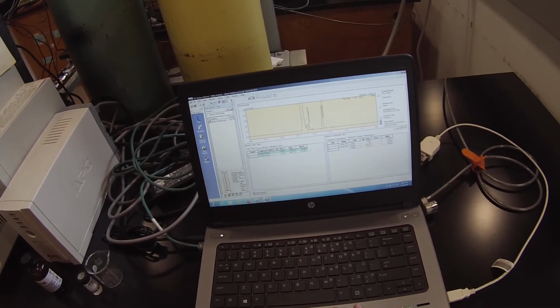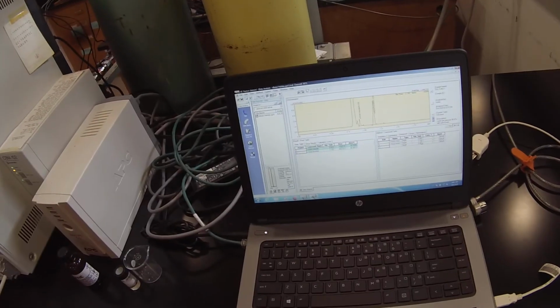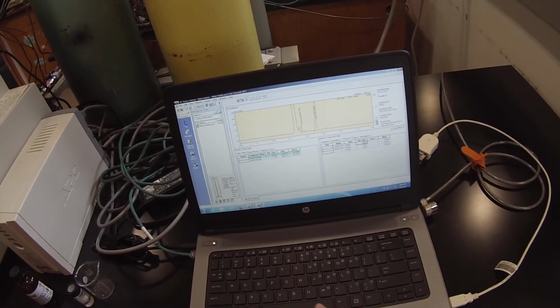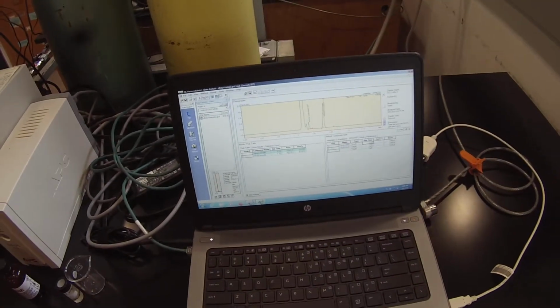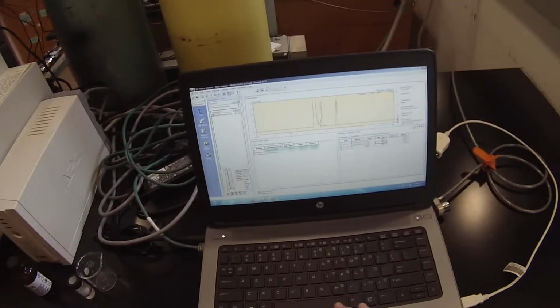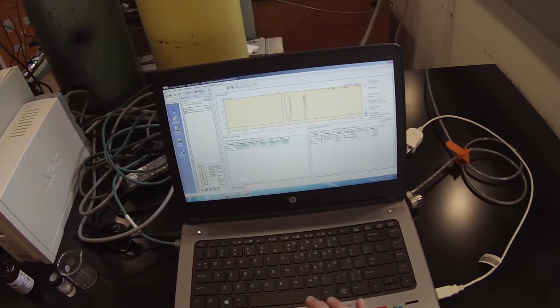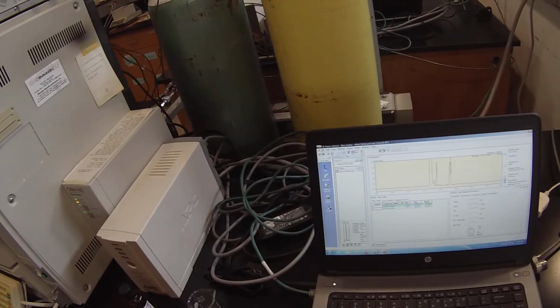Last year, the n-butyl chloride was at 0.90 and the n-butyl bromide was 1.19. I could actually change that to 0.93 and 1.15 if I wanted to reflect this year. They were close enough that it was picking them up correctly anyway. And again, I can save the data file.